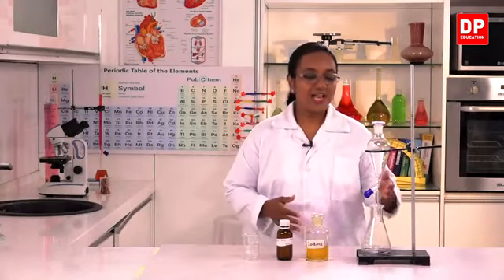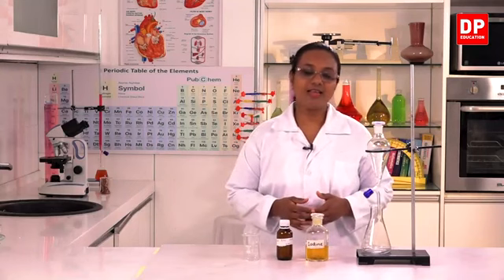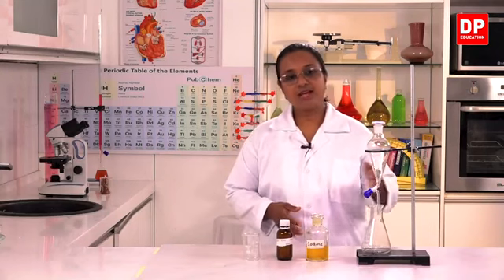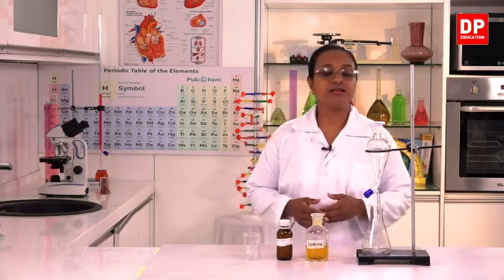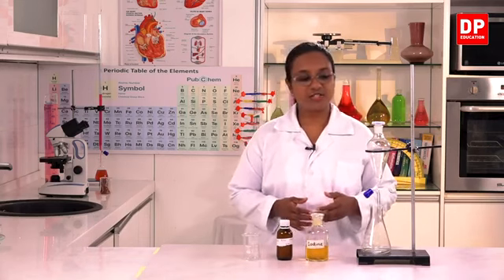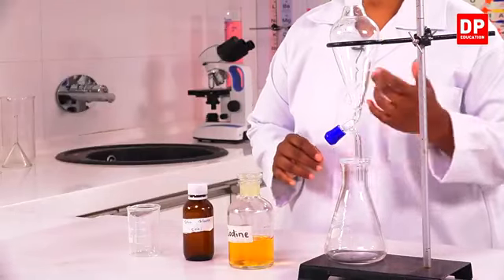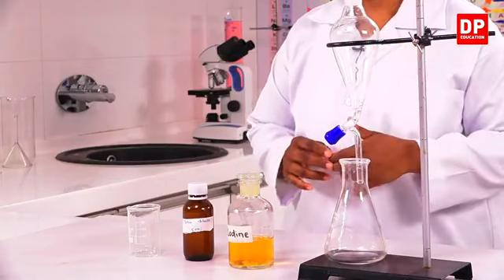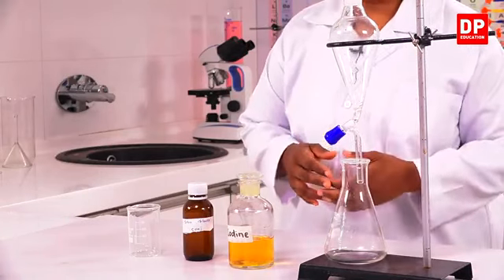Okay, students. Now, I am going to demonstrate the technique of solvent extraction. So, here I have the separation funnel. You can see it's a glass funnel, that's called the separation funnel. It has a lid and it has this tap where you can open and close the tap so that you can draw solution through the separation funnel.